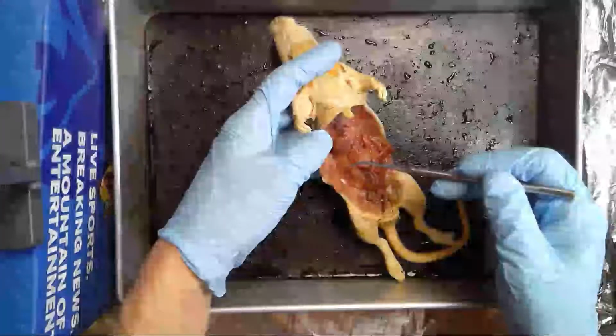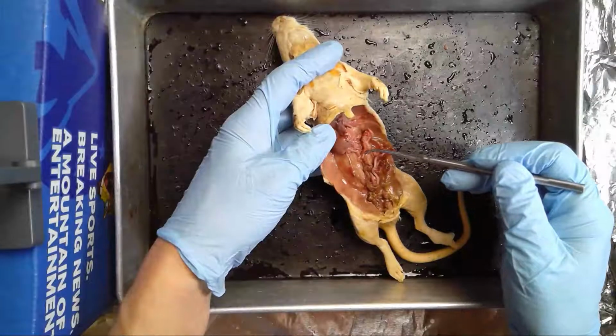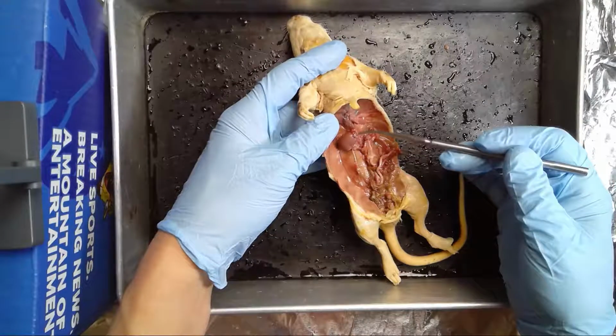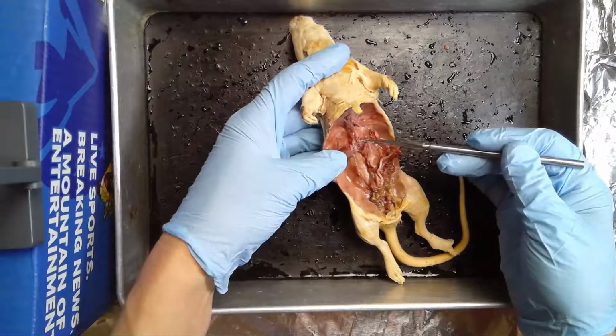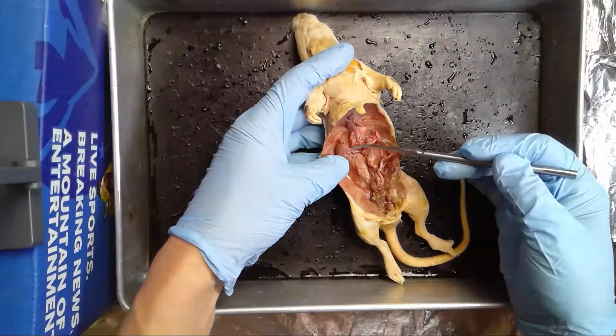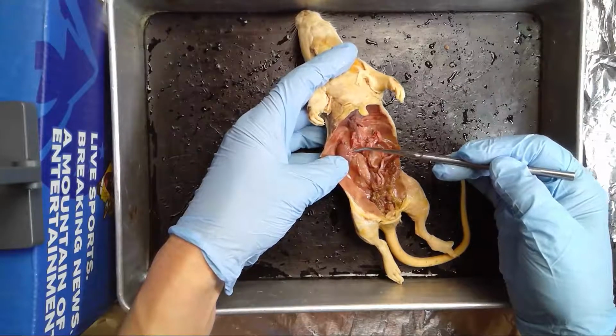So, cut it in half. Here's a kidney. You can see the adrenal gland right on top of the kidney. You can see blood vessels. So there's an artery and vein going to the kidney.